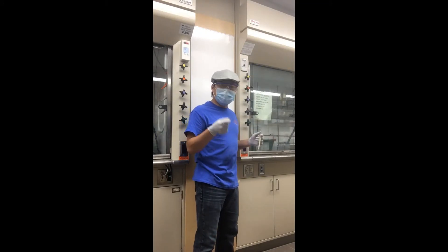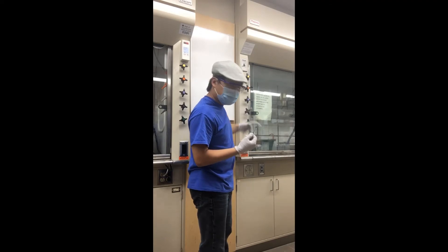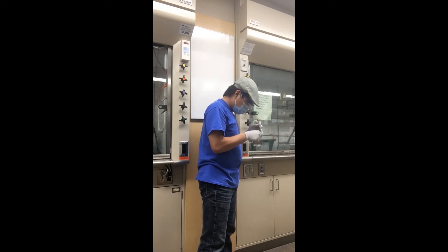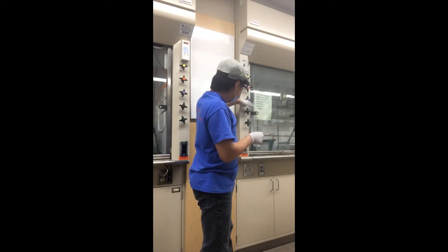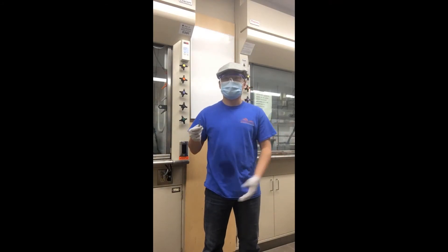Now that I have washed my wafer once, I'm going to dry it with nitrogen air. I'm going to repeat this process of washing and drying five more times.